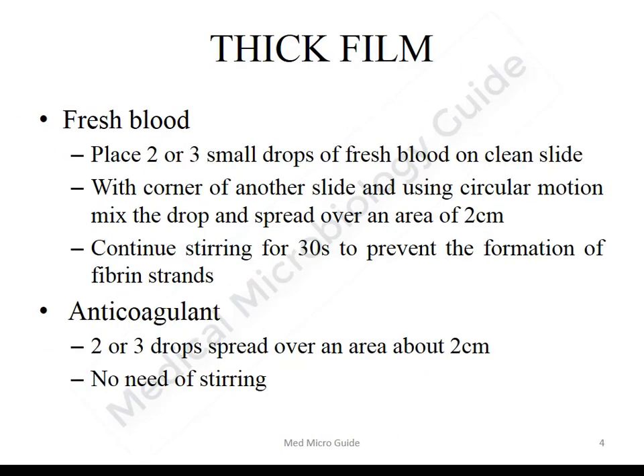Thick films can be prepared from both finger stick blood and EDTA anticoagulated blood. If doing the smear with finger stick blood, take two to three drops of free-flowing blood on the slide. With the corner of another slide, using a circular motion, mix the drop and spread it over an area of two centimeters. Continue stirring for 30 seconds to prevent the formation of fibrin strands.